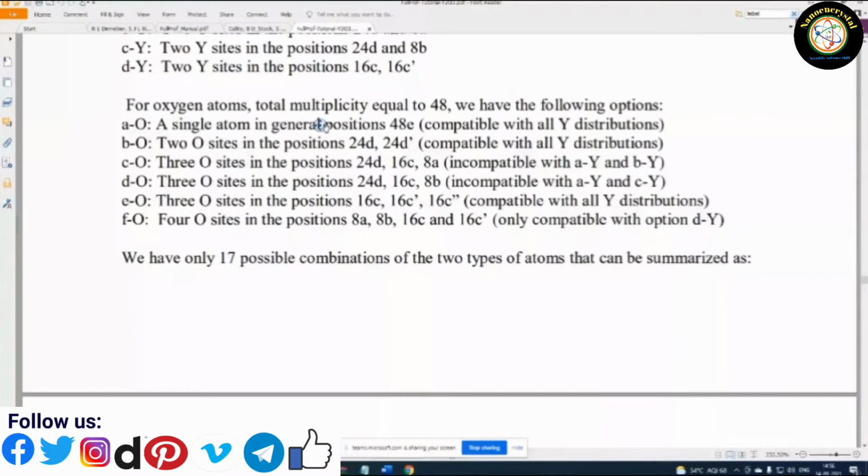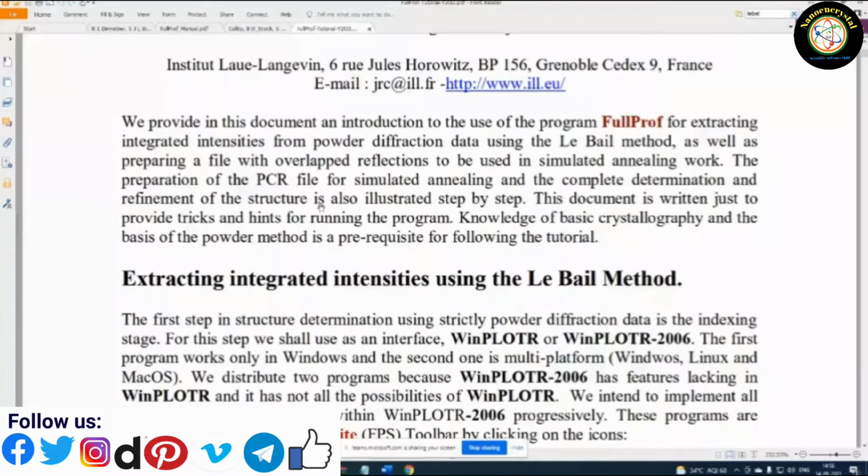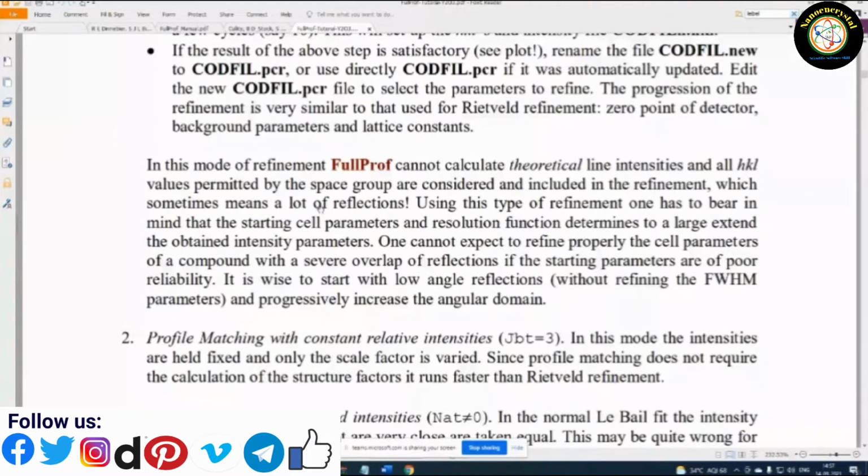I have a question, like I asked this before also. Suppose you're working on an entirely new system, and you're not able to get the CIF files or something related to it from the crystallographic database. Yeah, that's what I'm saying.